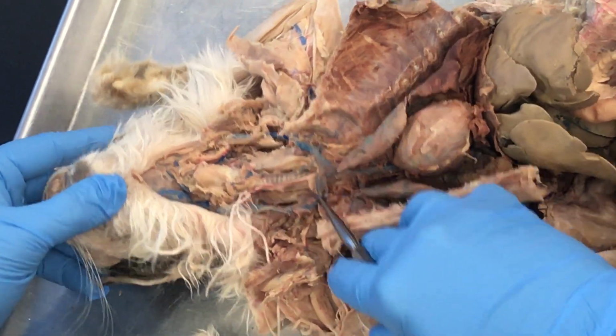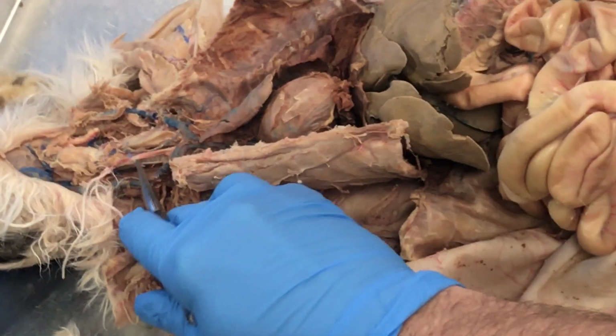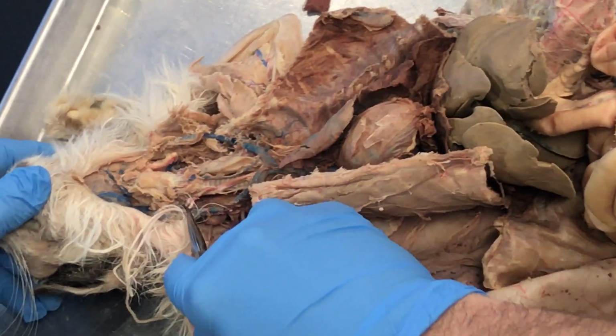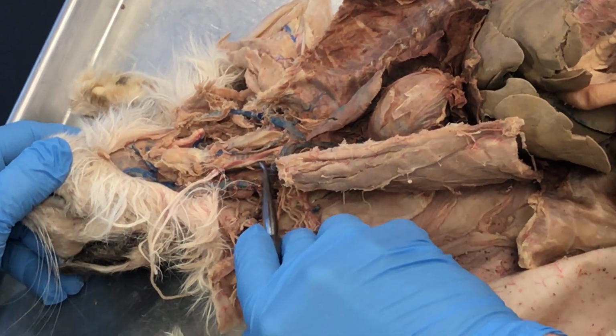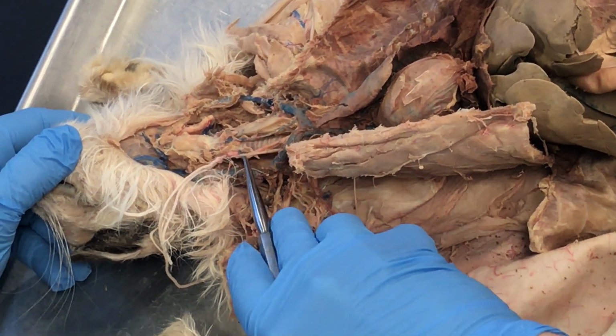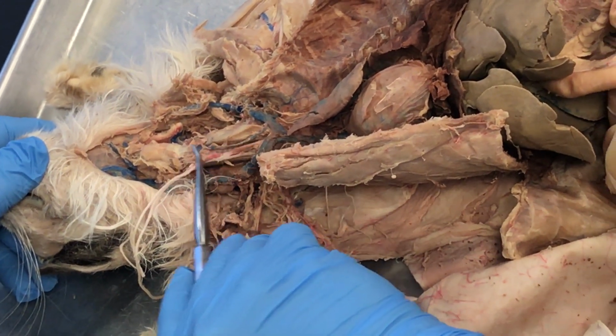Next thing you got is the vagus nerve. Now the vagus nerve, I don't see it on this side, but it's still intact on this side, and that's interesting because it's the side that gets cut for the injection. So the vagus nerve runs with the internal jugular vein and the common carotid artery. So common carotid artery is the red thing, and then the white thing right there, that's vagus nerve. Okay?